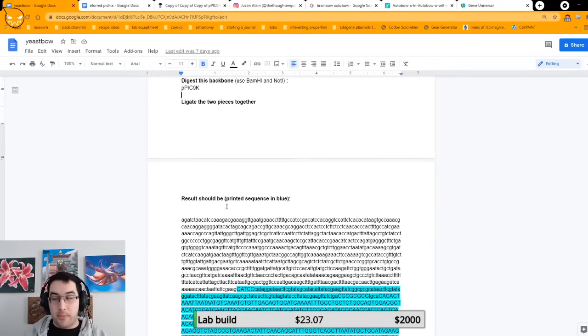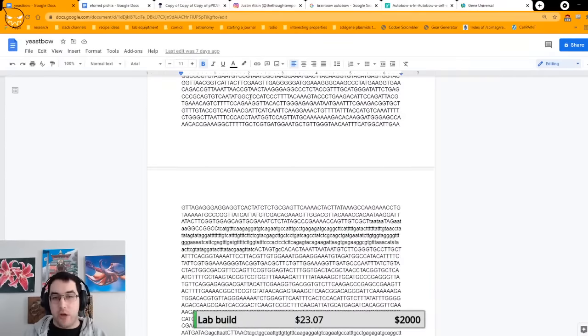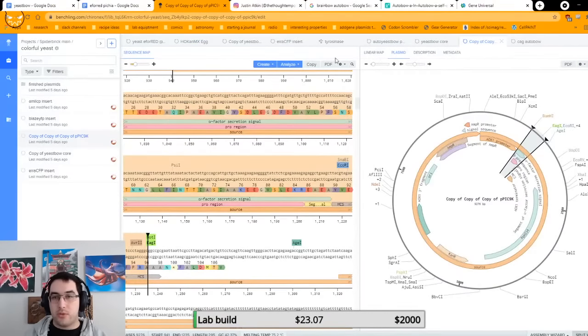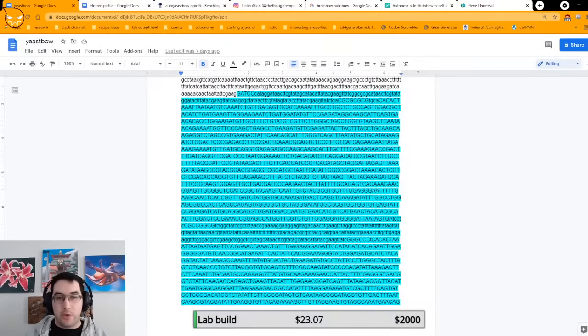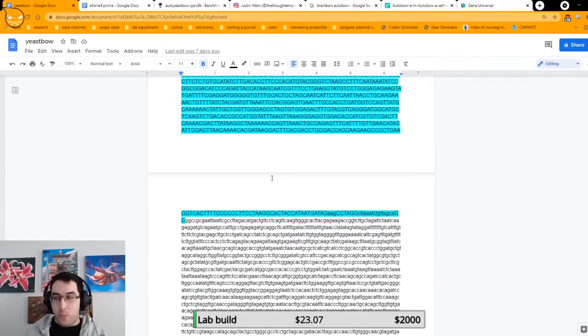But what I always put, to make sure that they know this is exactly what this is supposed to be, is I'll say the result should be, and then I'll highlight the printed sequence. So I'll literally go on this file, Command A, copy it all, paste that in, and then go back in and highlight the thing that I had them print. So this way they know exactly where the thing I told them to print should be and how it should look relative to the rest of the backbone.